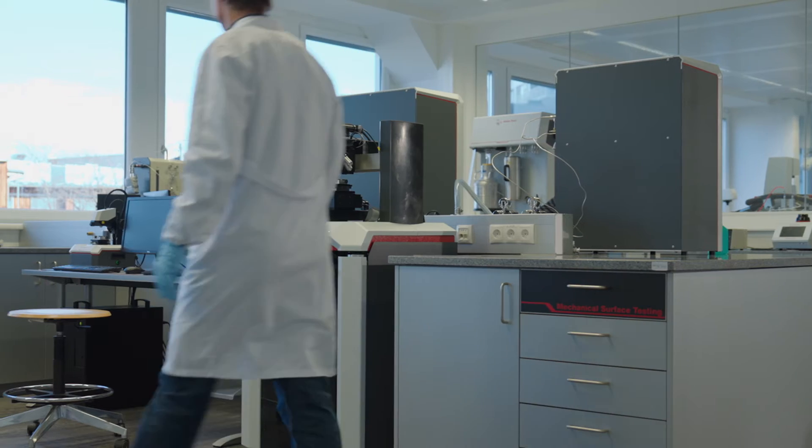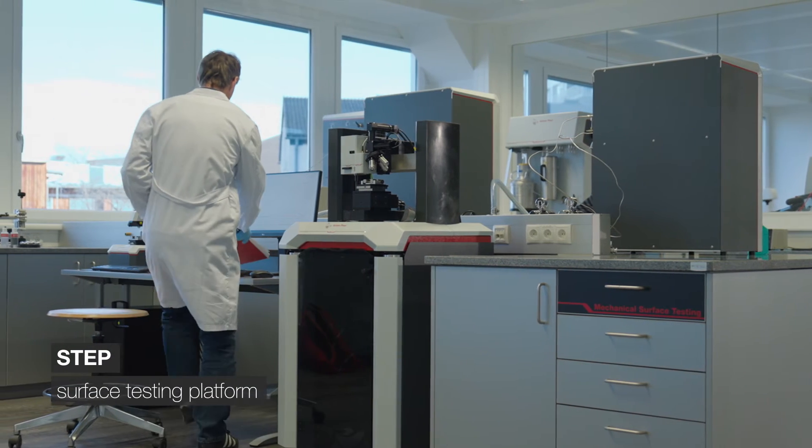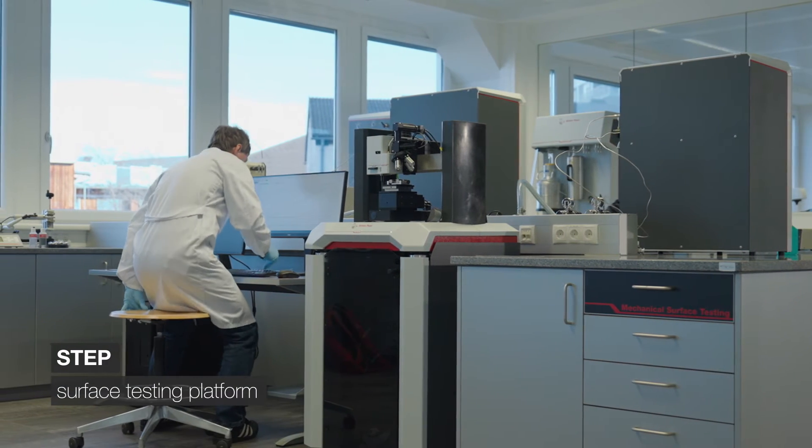Good adhesion of the electrode coating is indispensable for the production of high-capacity batteries with low risk of thermal runaway. The scratch test is an ideal test method for the verification of the adhesion as well as the scratch resistance of the electrode layers, and can help improve the deposition process.